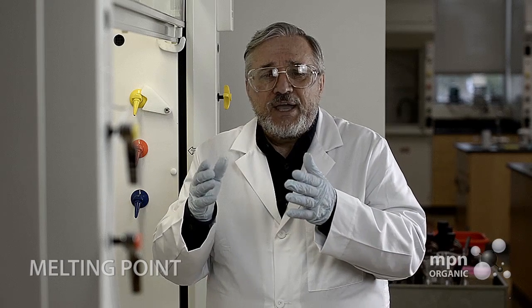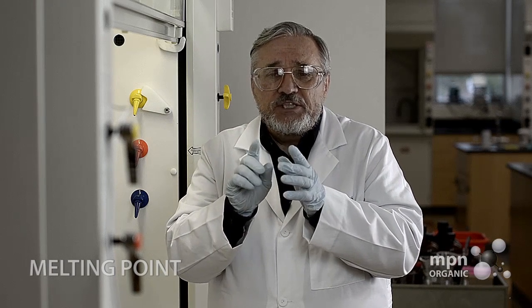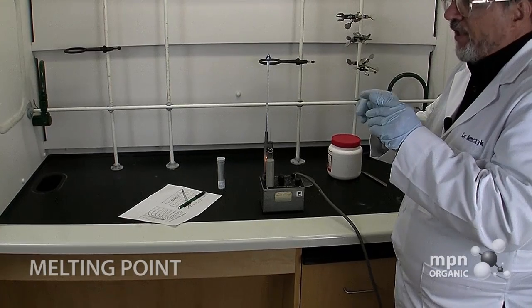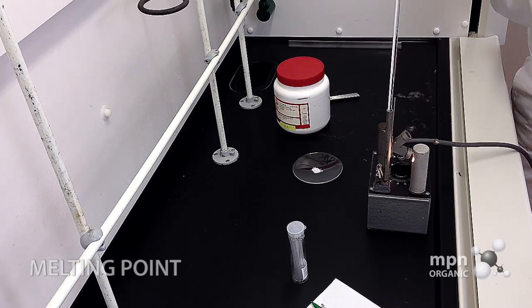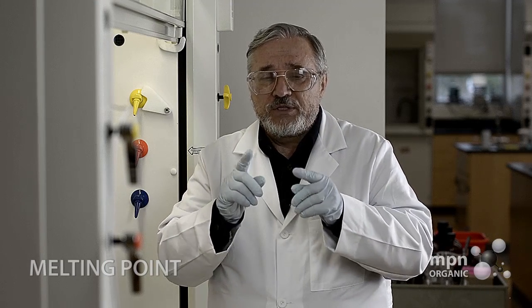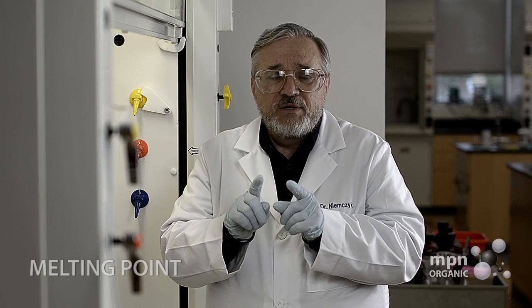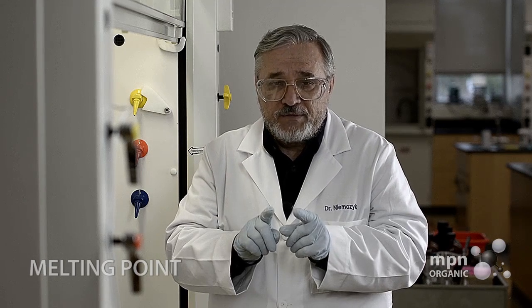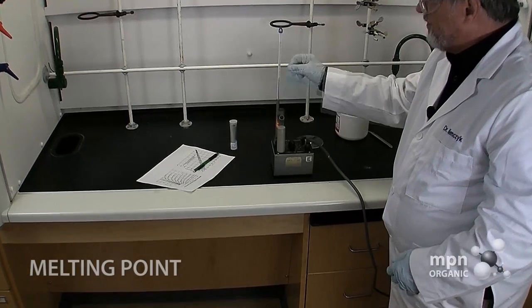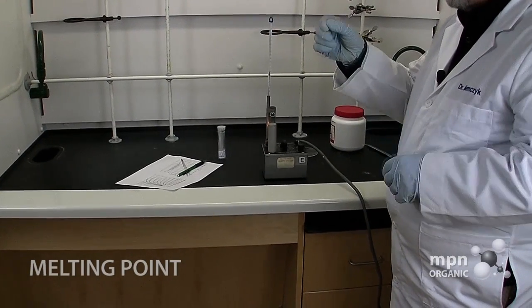Now, it's usually just a couple of degrees for a pure sample between when the sample begins to melt and when it finally melts. And those are the two temperatures that we report. That's called a melting point range. Now, melting point is a misnomer, obviously, because we're not going to report just one temperature. We're going to report two temperatures, the bottom and the top of what we call the melting range. So the only way to learn this technique is to do it, and you will be very surprised at how adept you get at this, because we do this a lot in the identification of the molecules that we work with.